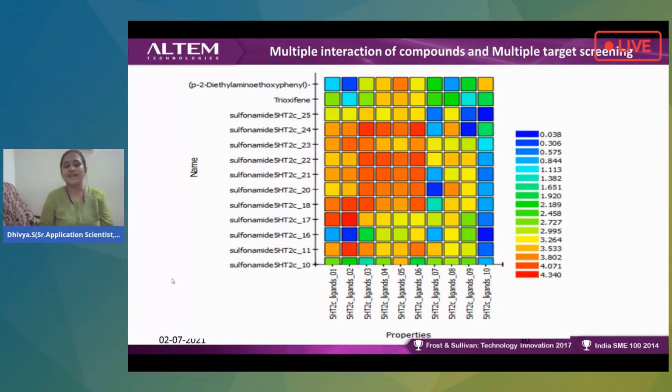And this is an example I want to show. Since we have been discussing accelerating the drug discovery process, usually with any tool we utilize, one drug and one drug target, or maybe multiple drugs, we usually try to see what the effect on binding energy will be and so on.